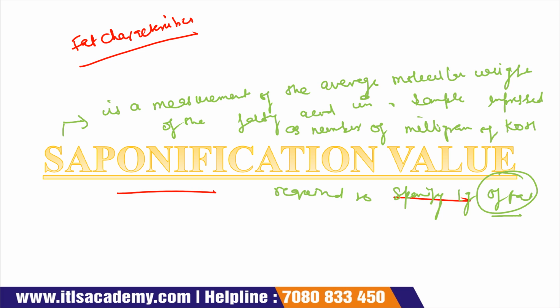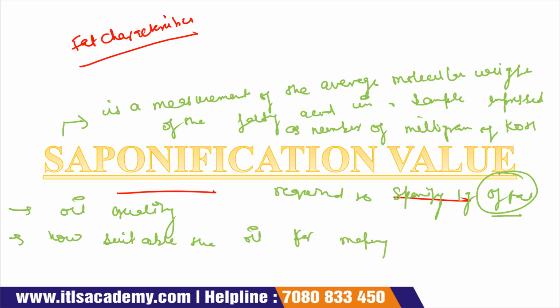This saponification value is also used to determine the oil quality, and to determine how suitable the oil is for making soap.